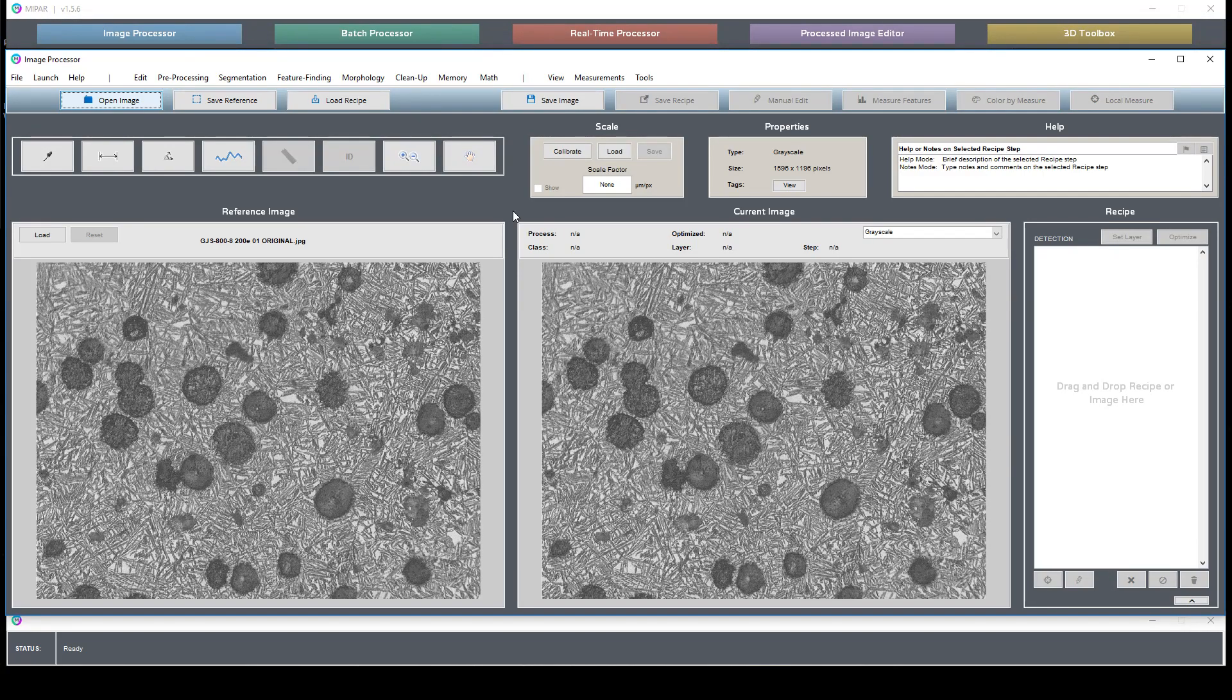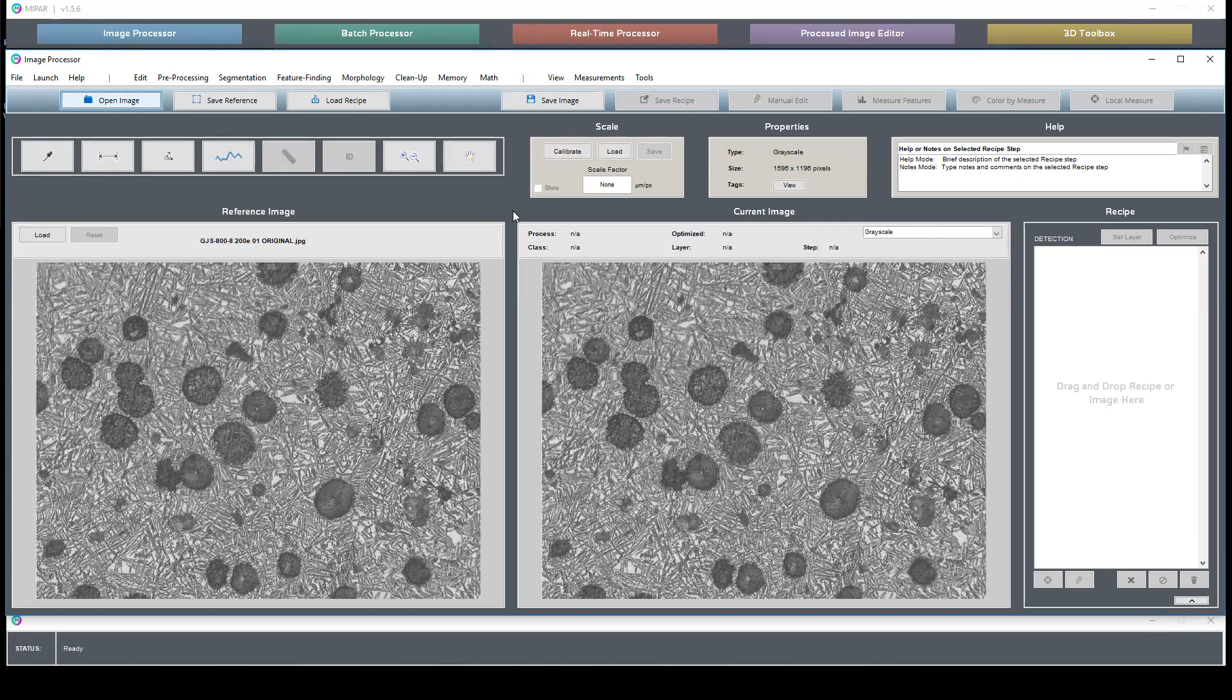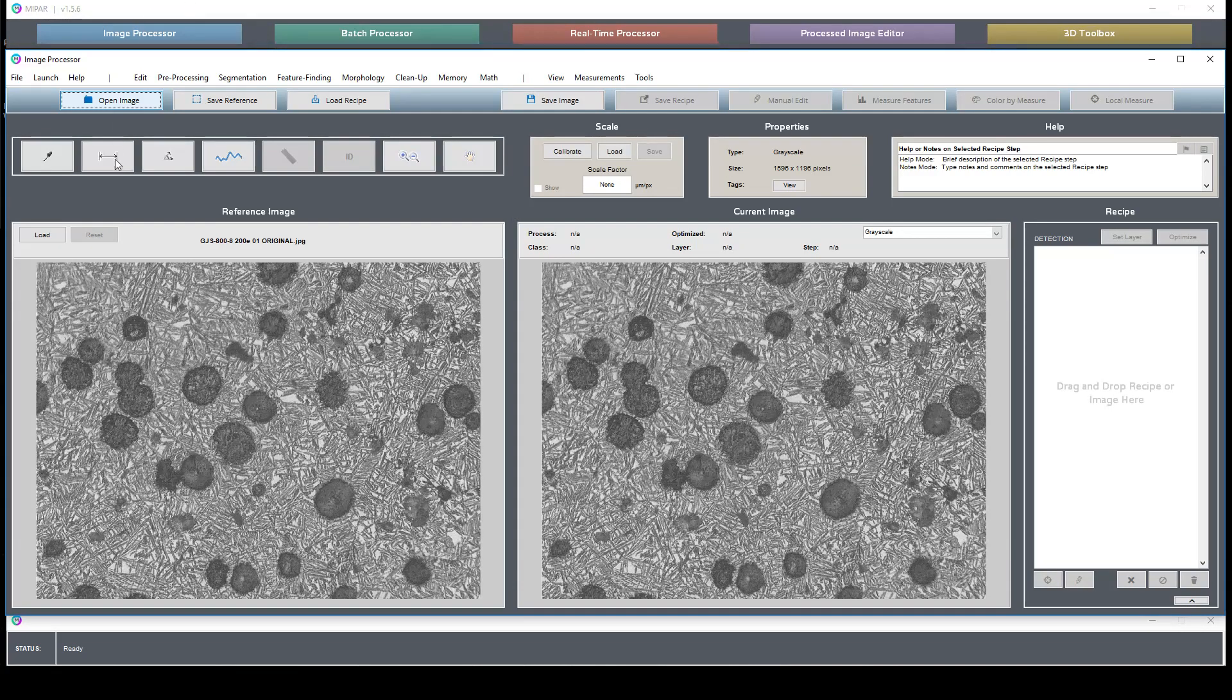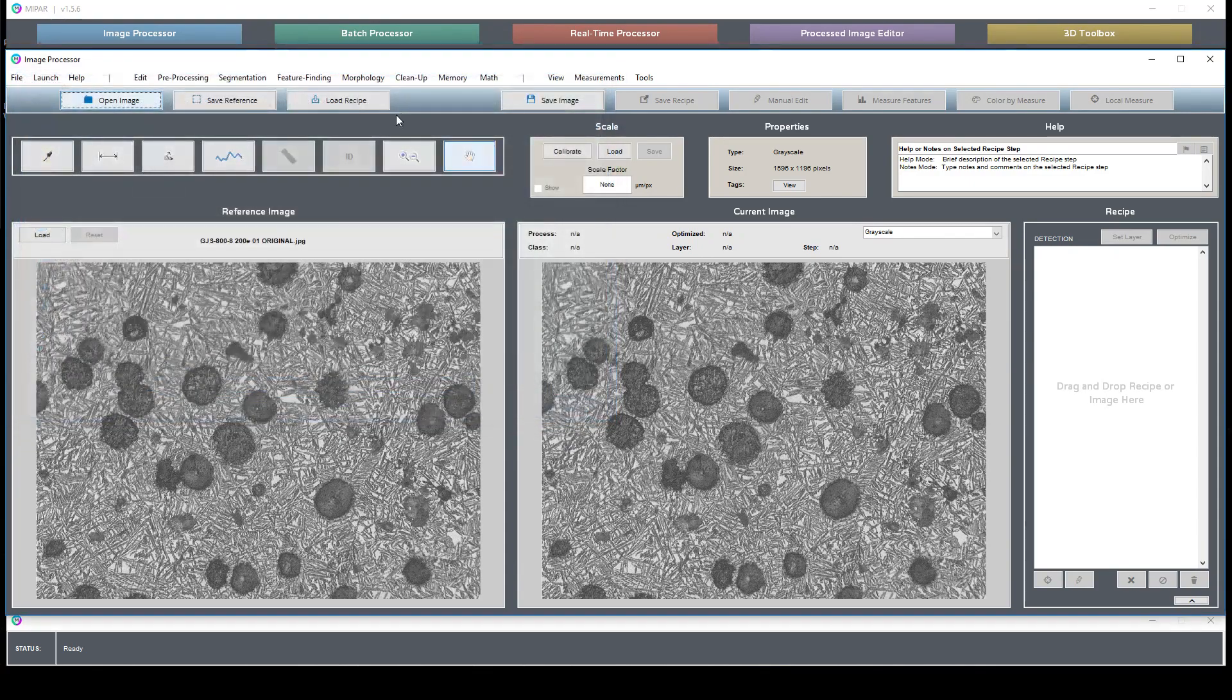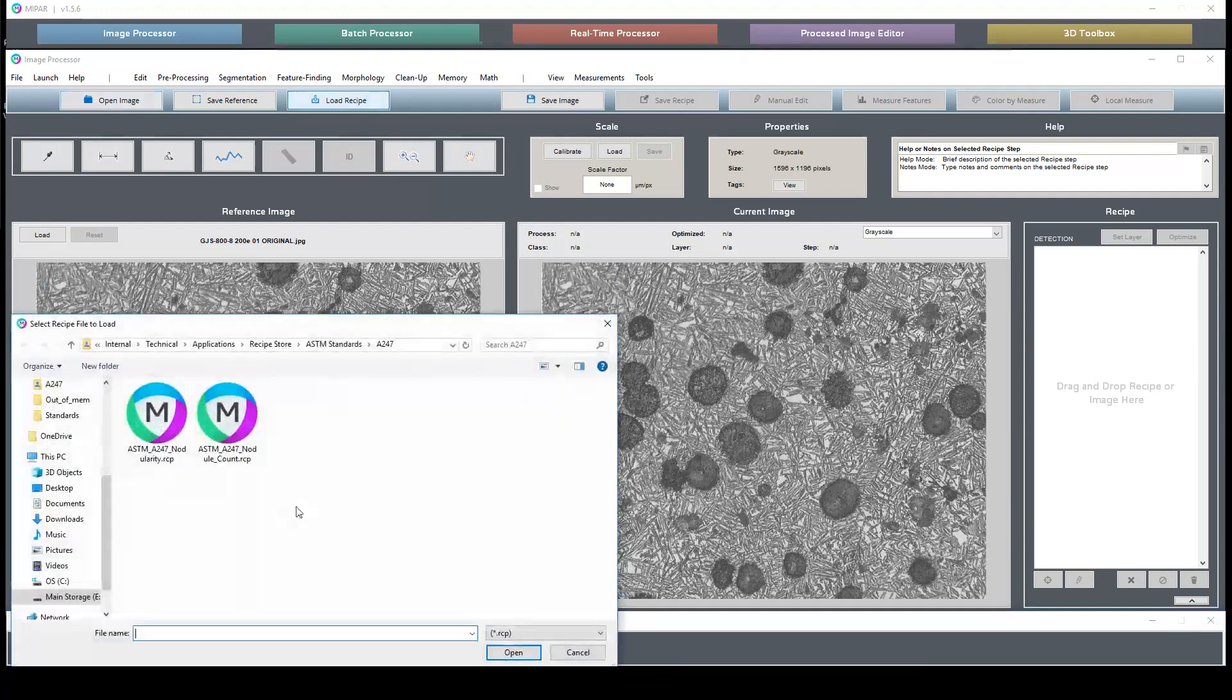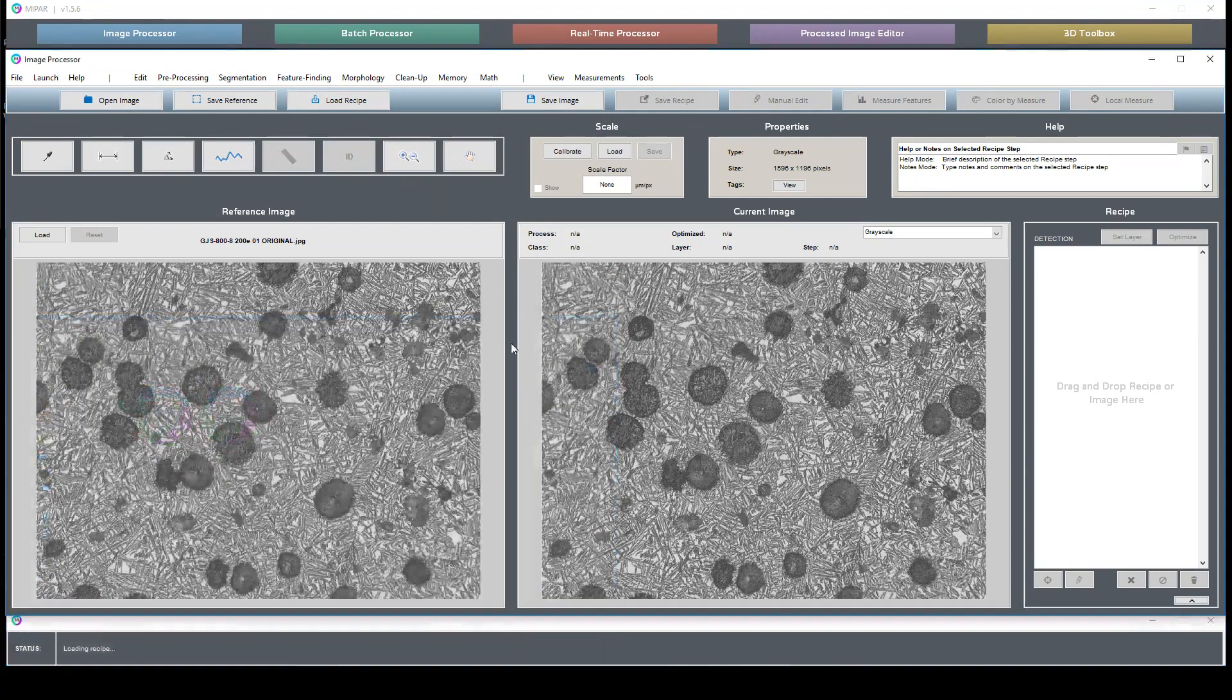So the two measurements we've been discussing is the nodularity measurement and the number density or the number count measurement of nodularity. I'm going to now load my nodularity recipe.